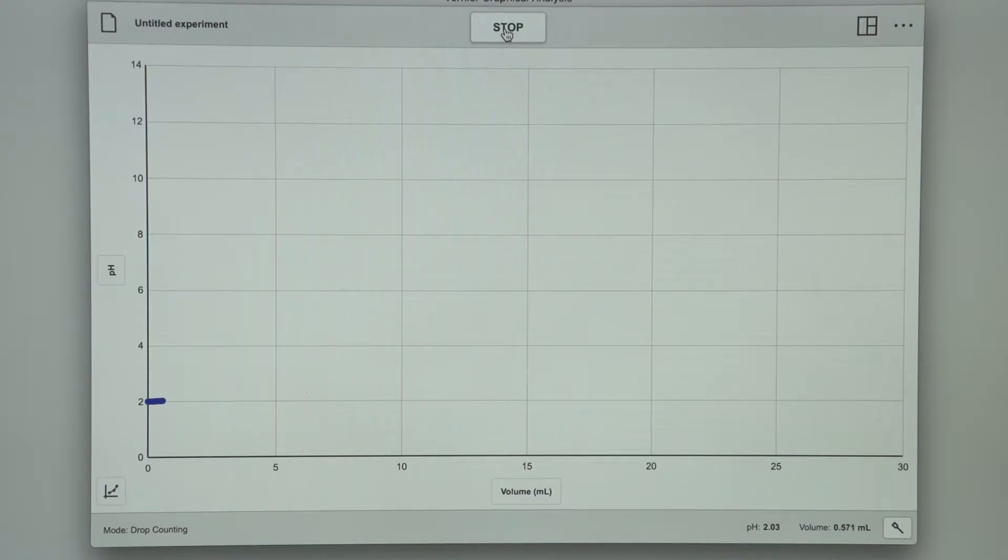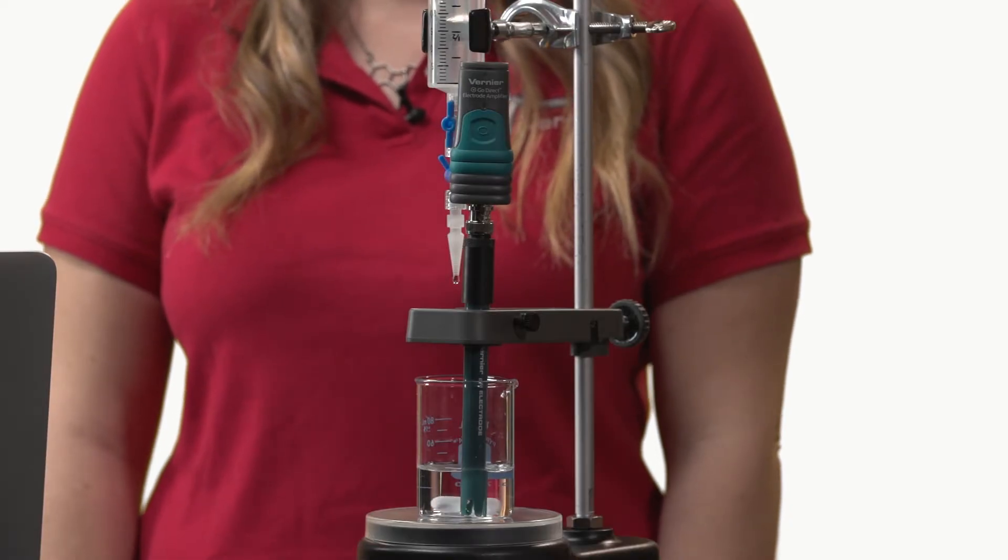The drops should be coming out at about one per second. The slower the drops, the better the titration data.